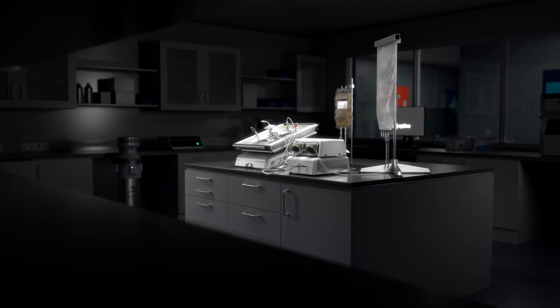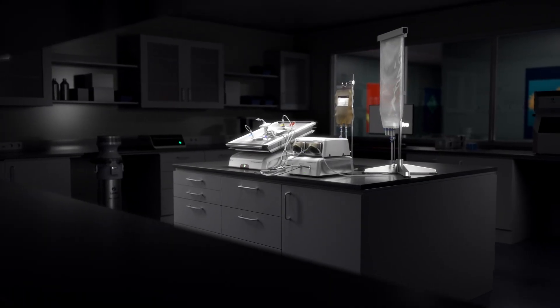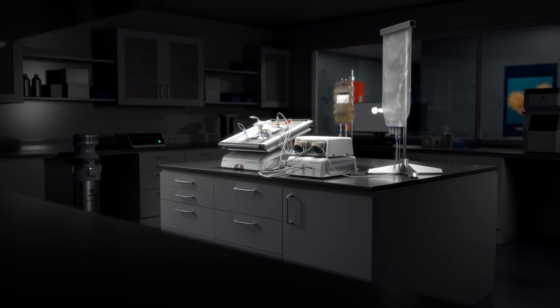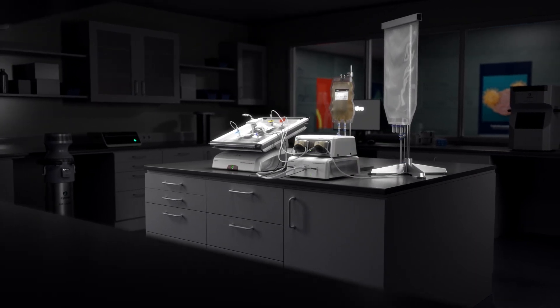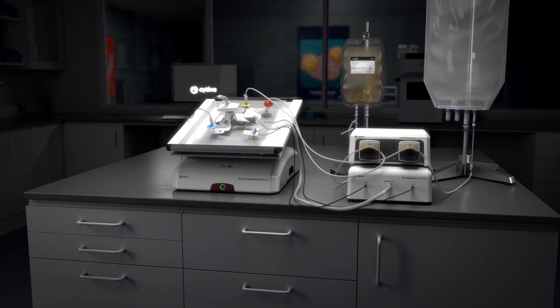The Zuri W25 cell expansion system is an easy-to-use system for producing large numbers of cells in a single-use cell bag bioreactor.